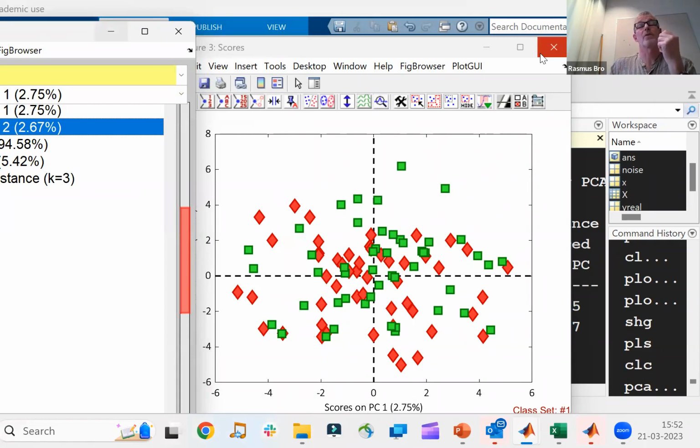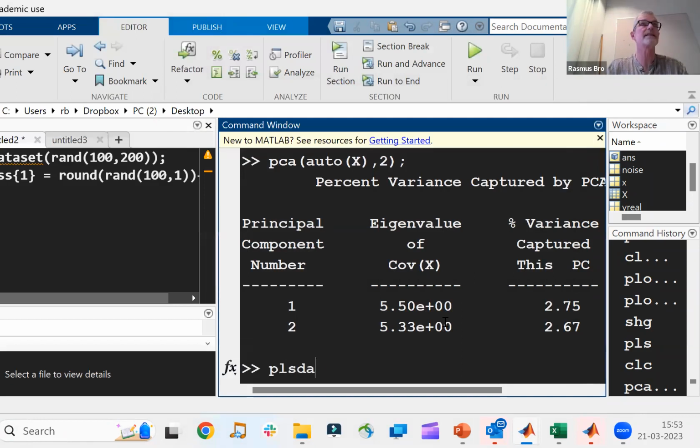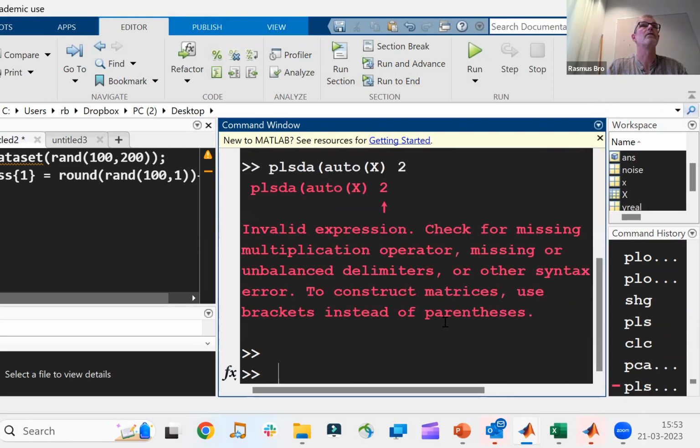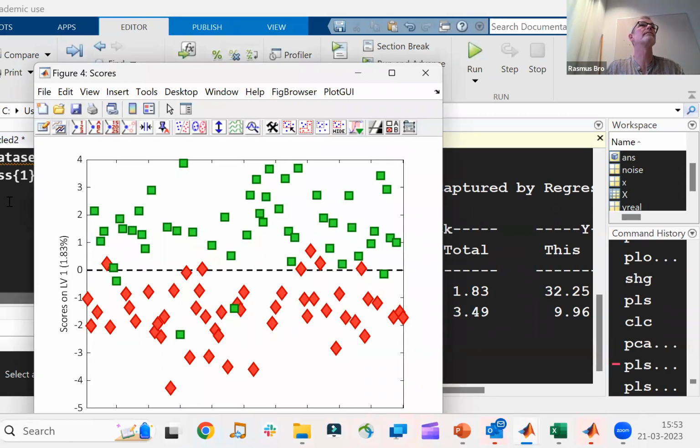But now, what is often happening in metabolomics is that people will start out doing a PCA and see if they find a grouping, but then maybe they get a little bit desperate, and then they say, okay, let me do a PLSDA on the data. And see if I can actually find a classification model that can distinguish between my sick and healthy people.